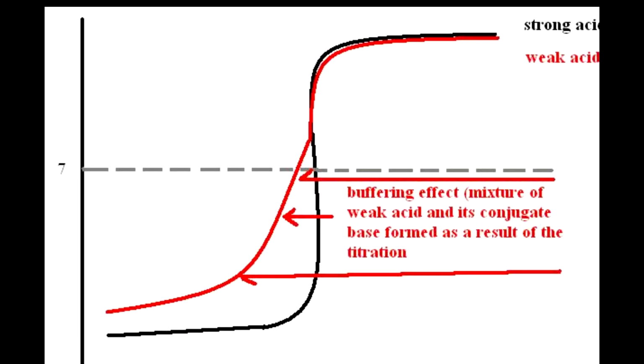The reason this works is related to the titration curve you see here. For strong acid, it's a very steep curve. One drop will convert it over to the blue color, so it's very easy with strong acids to go beyond the titration point, so great care needs to be taken.